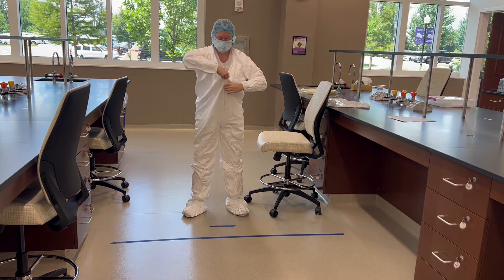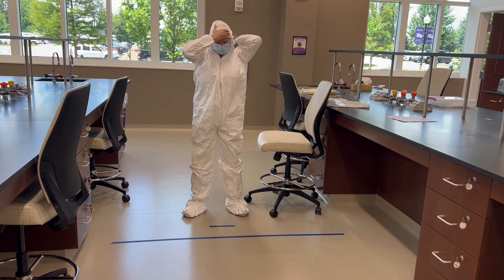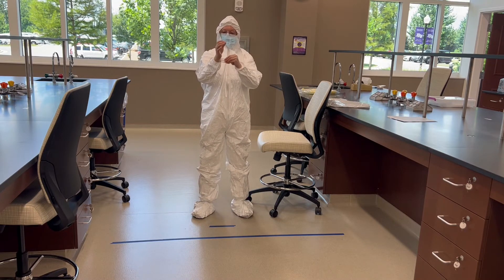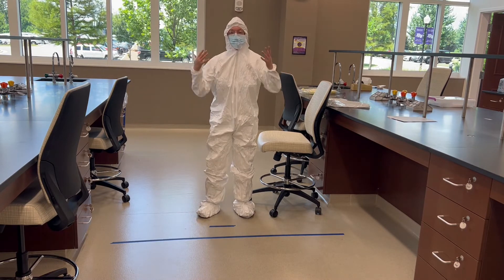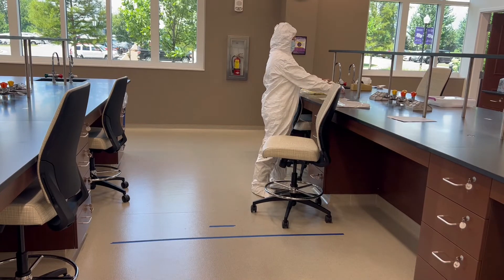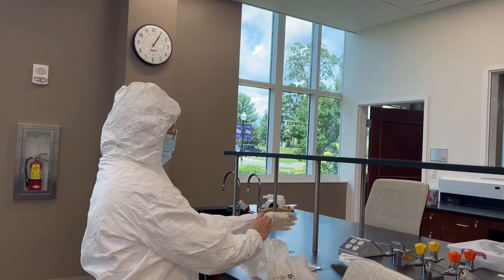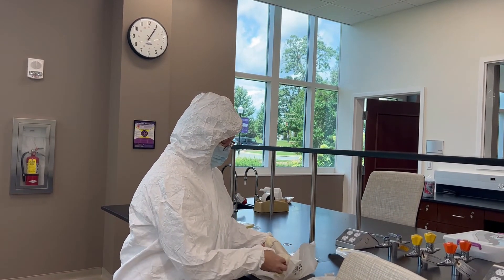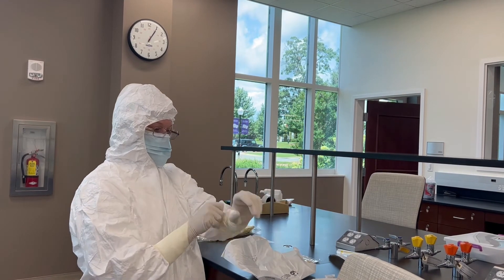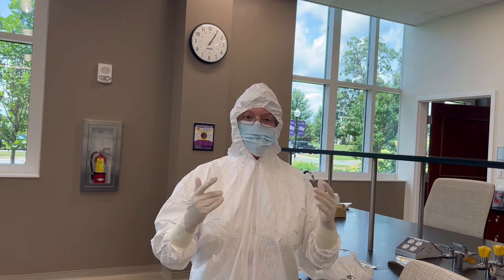Arms in, then zip. Hood on — and again, there are loops on the inside that your thumb goes through. This is what you would actually be wearing if you work at Cone Health in the clean room in the IV room. Then you go right back to your sterile gloves and put them on the same way demonstrated before. Before entering the clean room, you must sanitize your hands with 70% isopropyl alcohol, and also do so routinely as you're working in your hood.